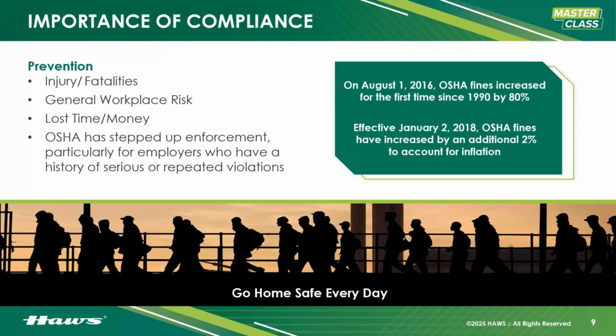Now, OSHA has stepped up enforcement and will continue to step up enforcement, but on August 1st, 2016, they finally increased fines for the first time since 1990 by 80%. And then effective January 2nd, 2018, we have finally an additional 2% to account for inflation for those fines, which had never increased. And now they are adjusting. So it's more important than ever to adhere to these.